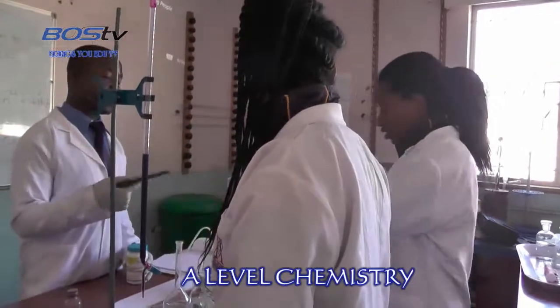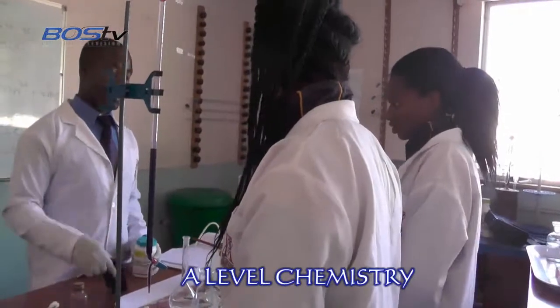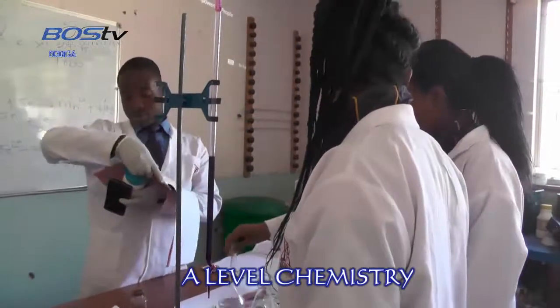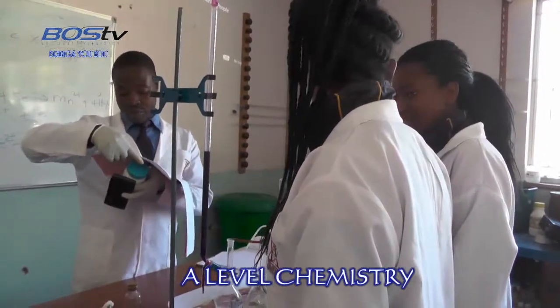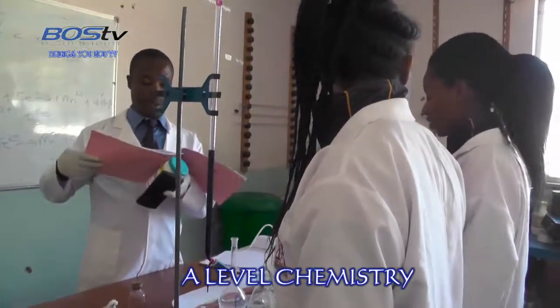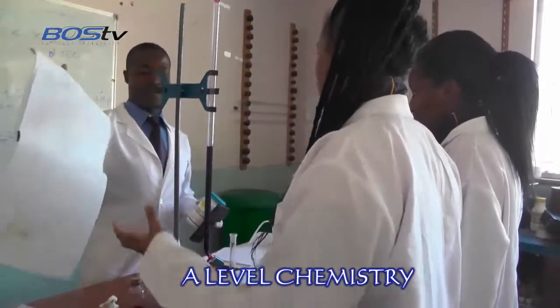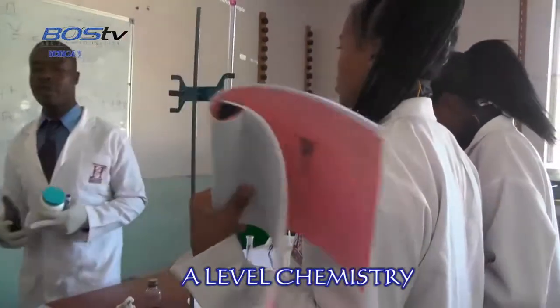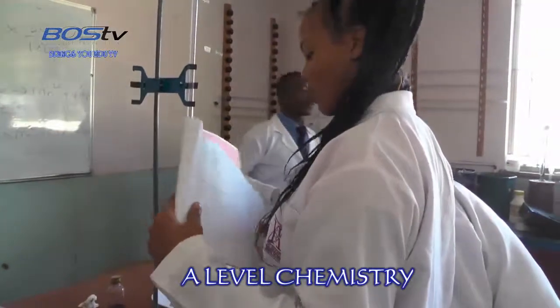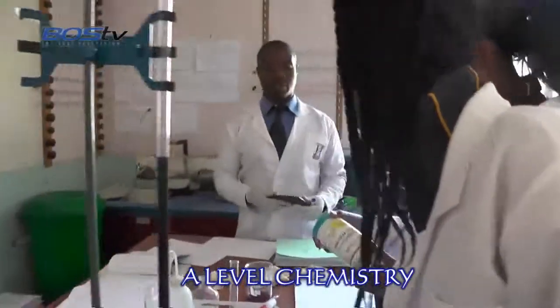What did you use to measure FA4 that you used in the... 0.1 over your actual value of FA. Yes, that's a plus or minus 0.1 over your actual value of FA. Alright, calculate. This is the solution.